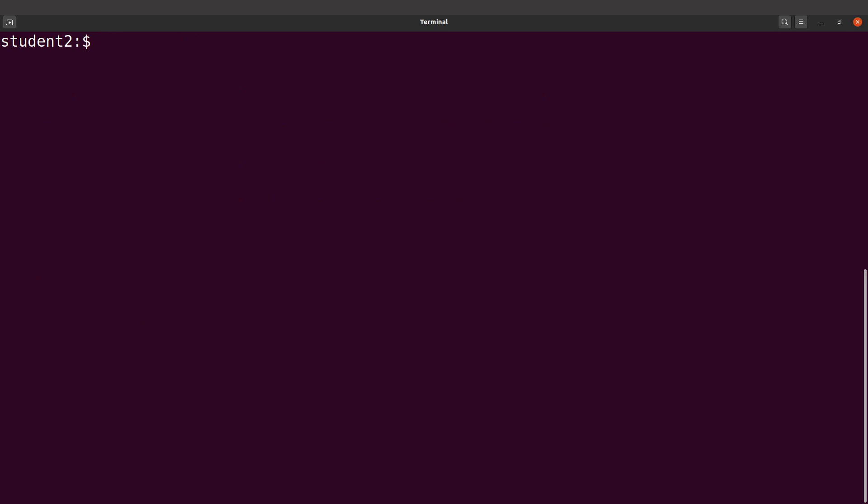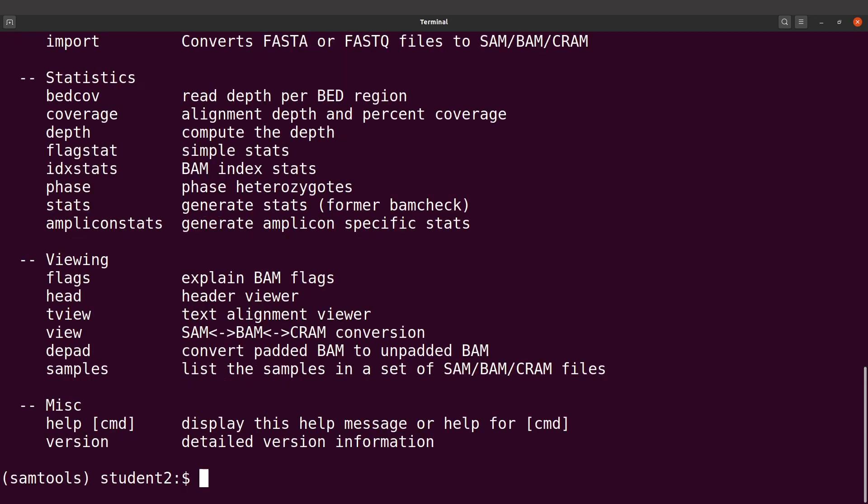Let's clear the screen and continue. We're going to test samtools, so we need to first activate the environment. We type conda activate samtools, and then we can type samtools. Perfect, so everything is now okay for us. That is it.